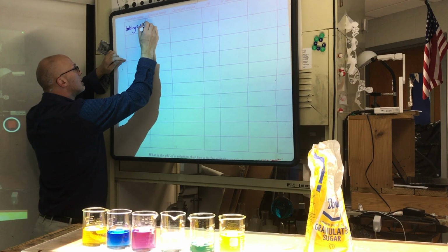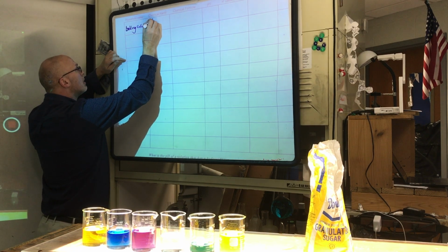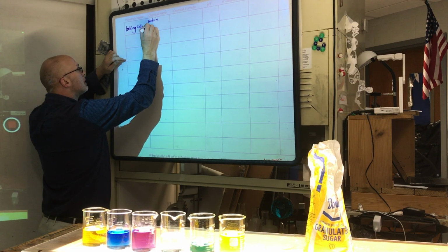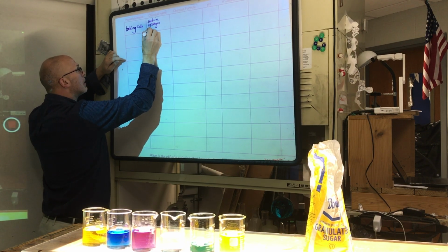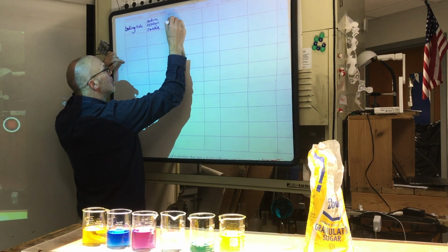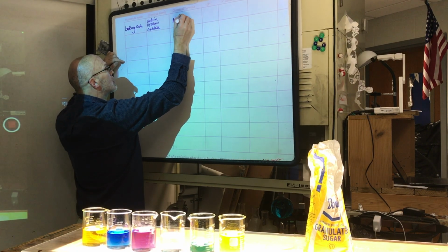Chemical name was sodium hydrogen carbonate. Chemical formula was NaHCO3.